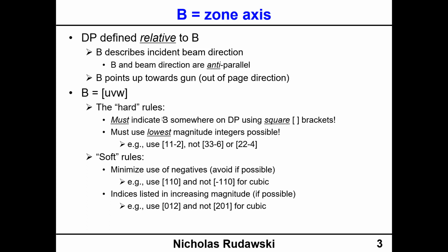When you record a diffraction pattern, it's going to have a scale bar, okay? And that scale bar will be in reciprocal length units. And if the person managing your microscope is doing his or her job properly, that scale bar should be accurate and calibrated, okay?